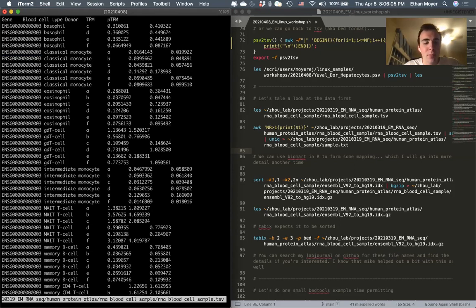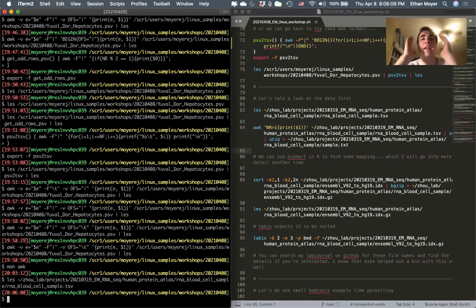Okay. So why do I bring this up? I bring this up because, right, if we're downloading data from the internet, there could be various ways that we can represent it, right?